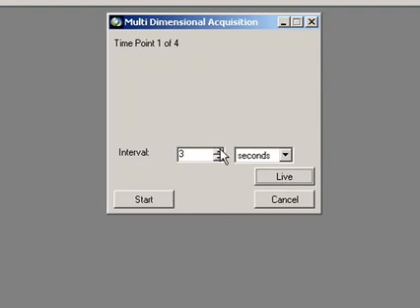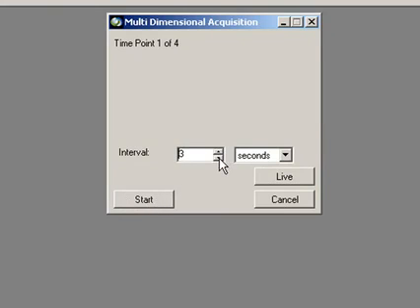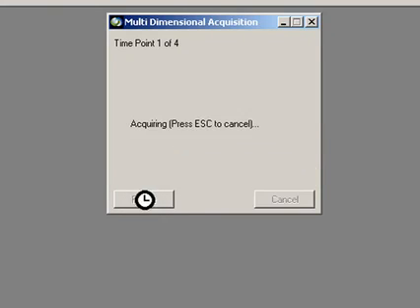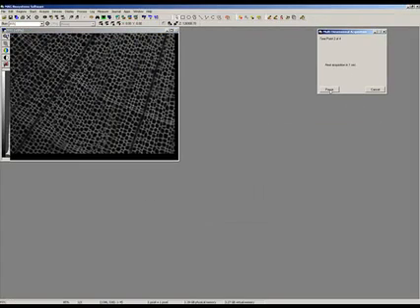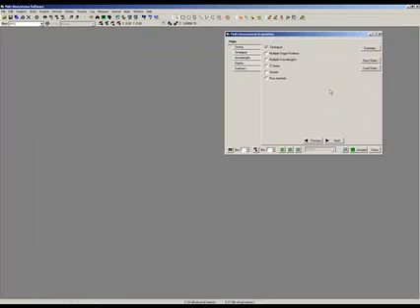And F2 stops. And I can just say, actually, now I want to do it every four seconds, so I can make changes at this point. So now I can just say, let's take that down to 2, and just say start. And you can just see it snapping away, taking new images as it goes along.